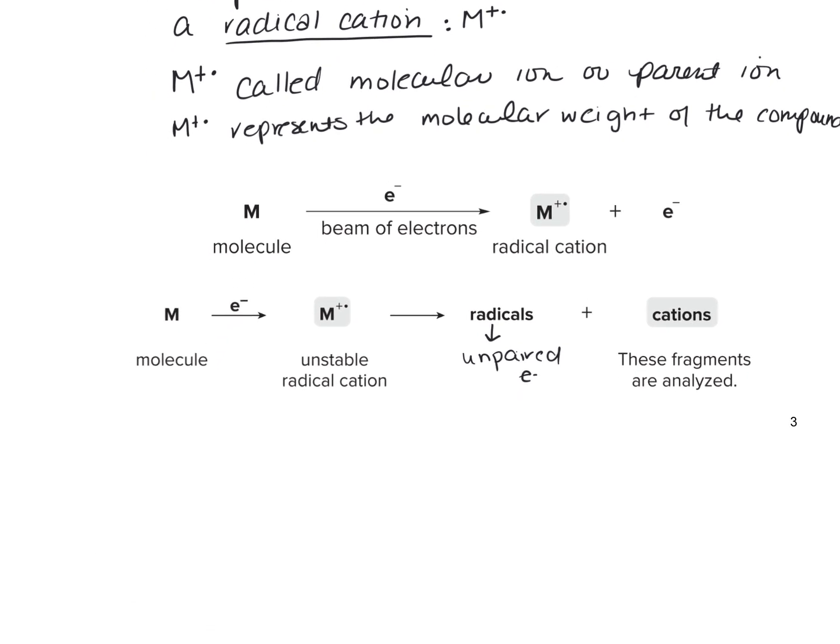The mass spectrometer analyzes the mass of the cations.